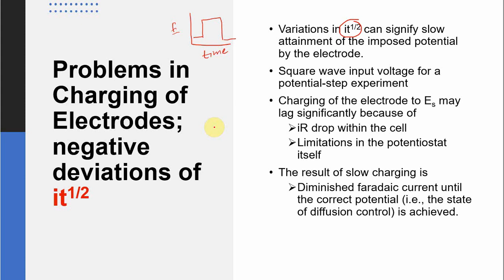So what we see is that if it is a proper experiment, then when this part which was Es is here, it leads to this it, that is the instantaneous current, and basically the current rises like this, and then it slowly diminishes, that is it gives a kind of exponential behavior. Otherwise it is not going to happen. It will not give this voltage, or the transformation will not be taking place in complete form.